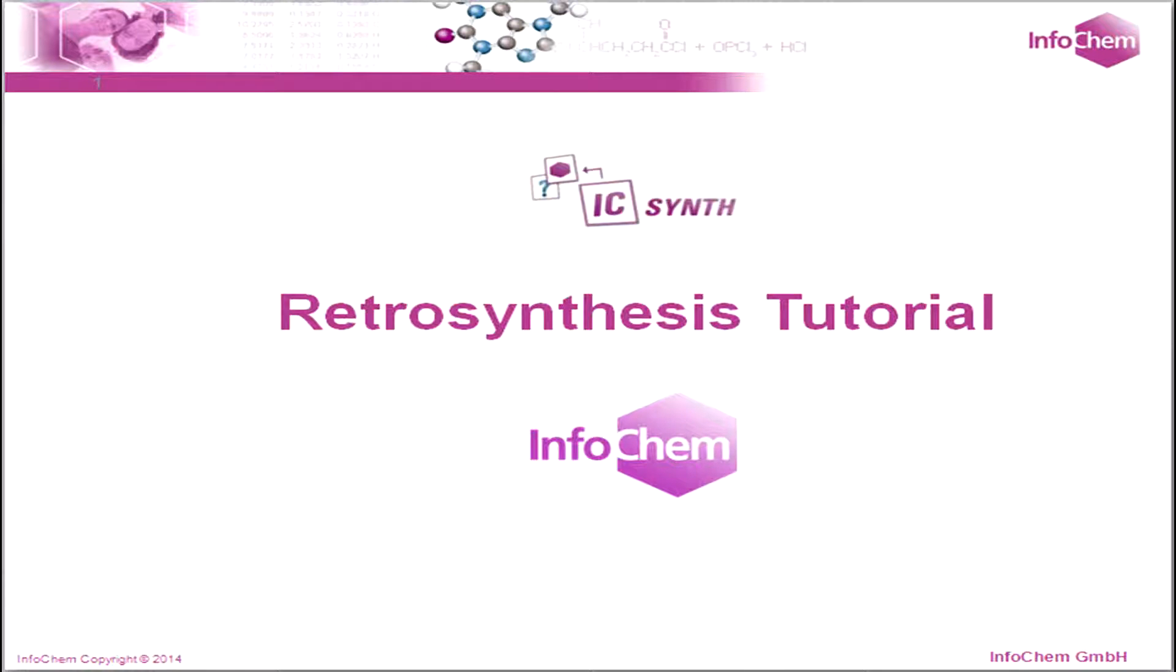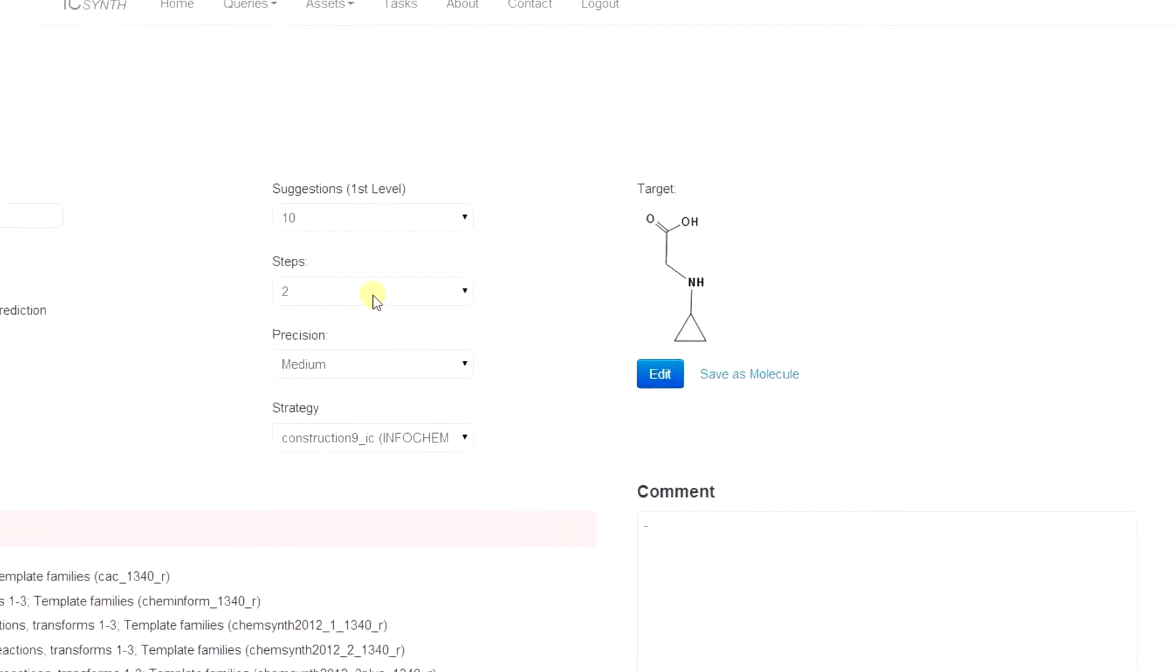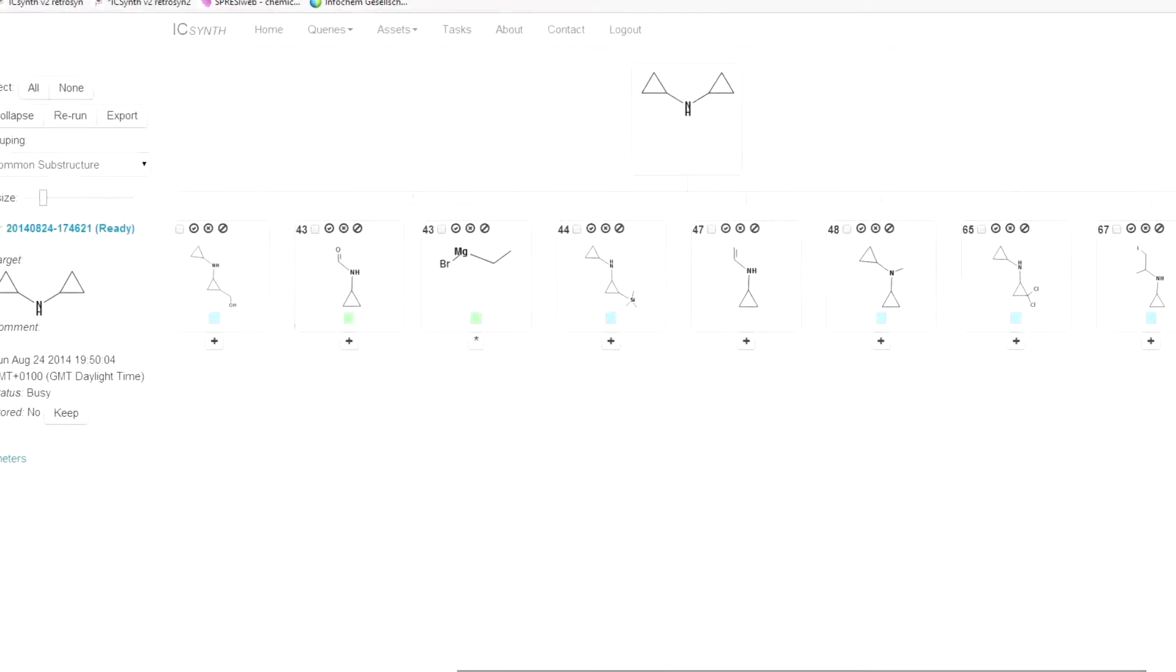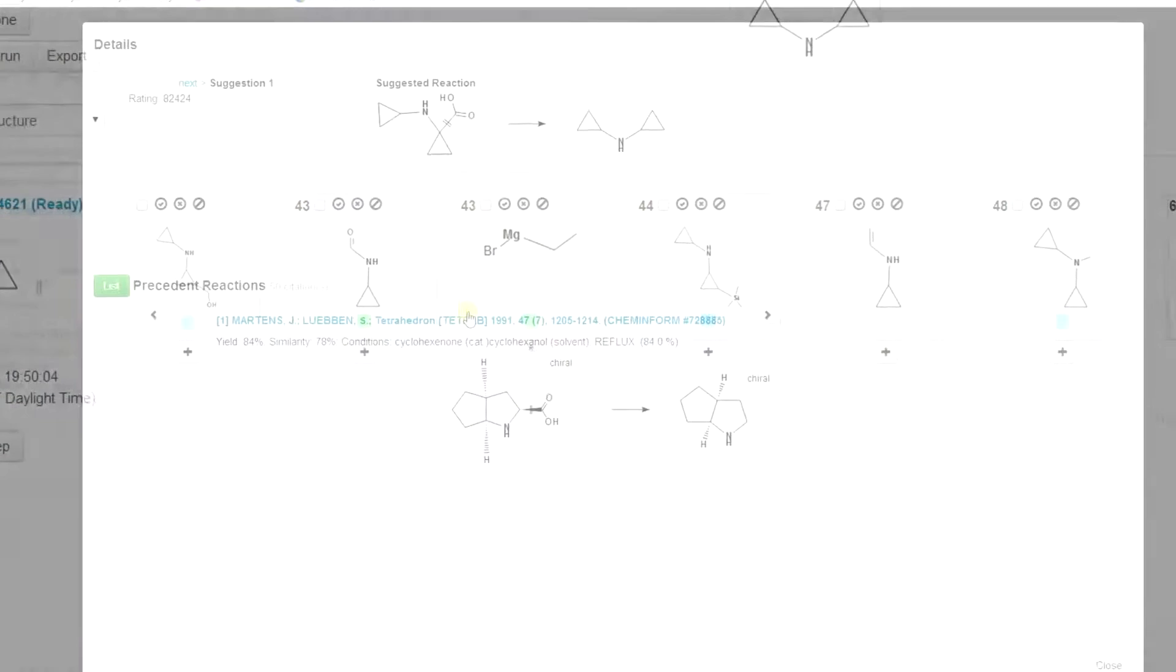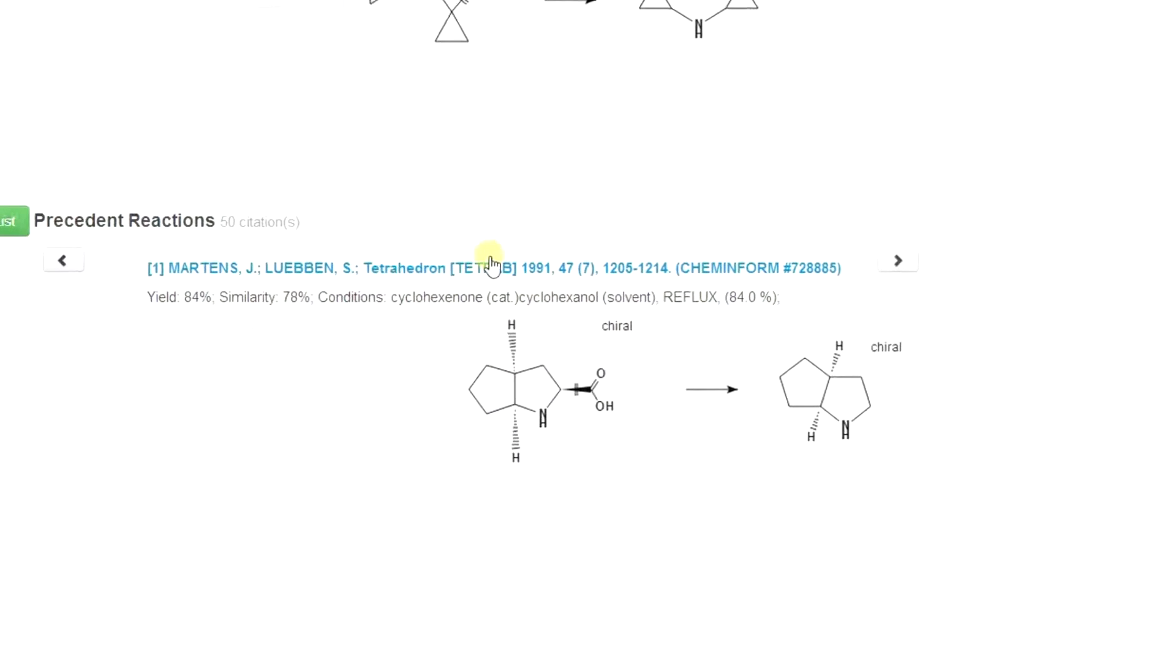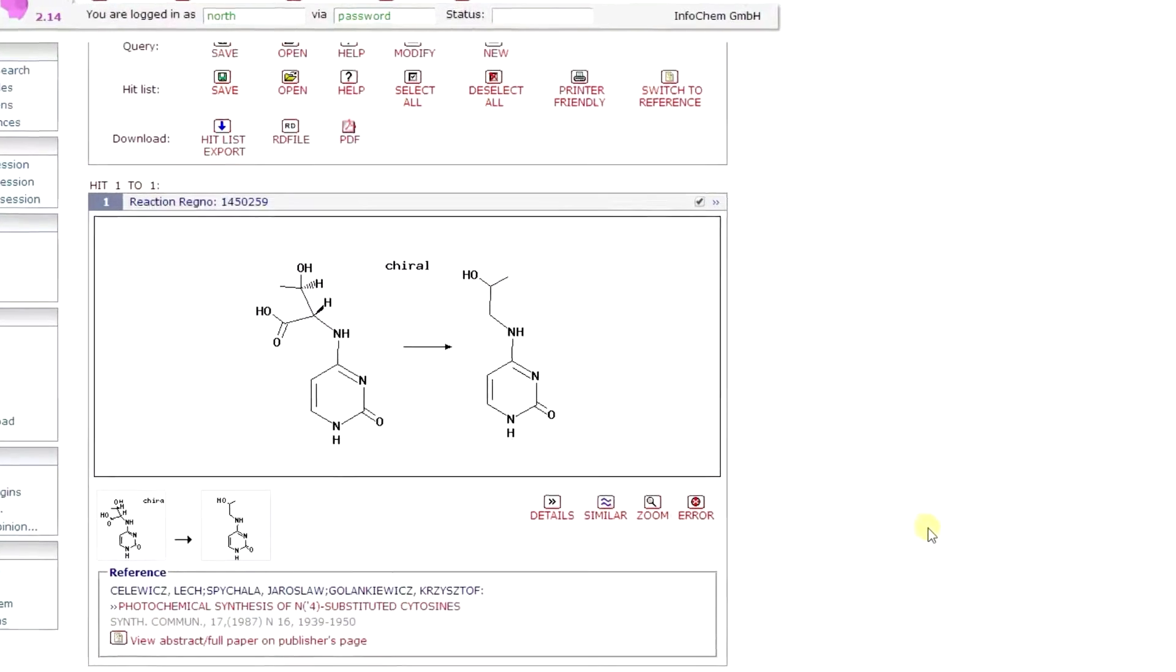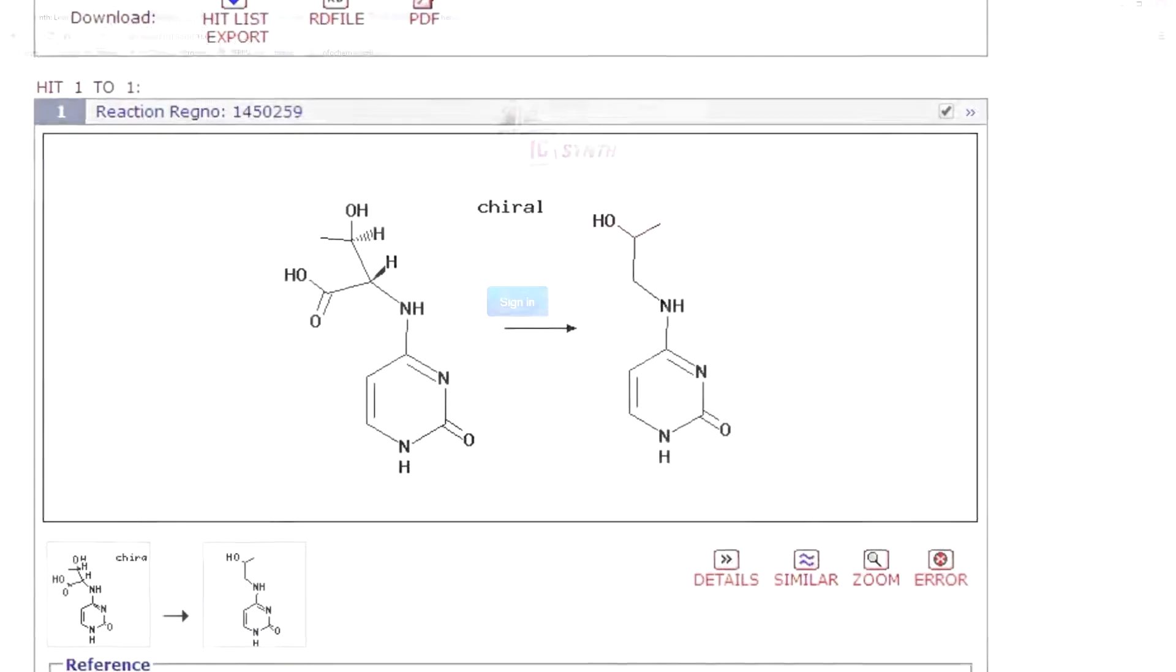Welcome to the ICSynth Retrosynthesis tutorial from InfoChem. InfoChem's ICSynth is a powerful computer-aided synthesis design tool that enables chemists to design new synthetic pathways for target molecules. This video will introduce you to ICSynth and show you how to use the Retrosynthesis features.